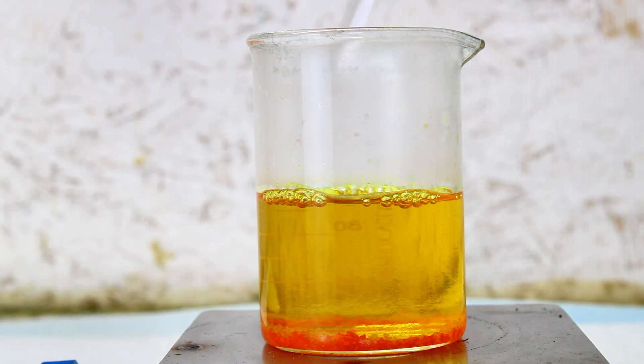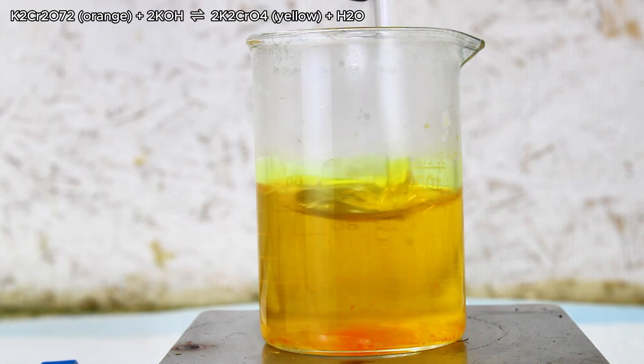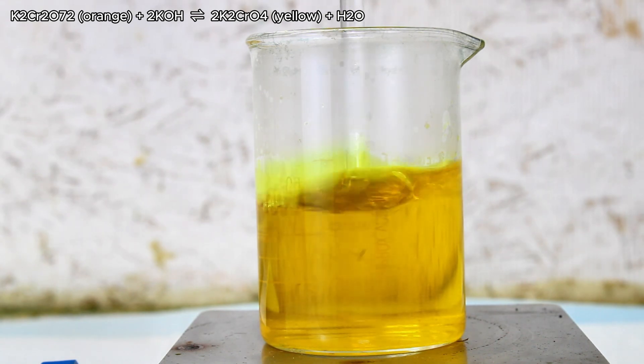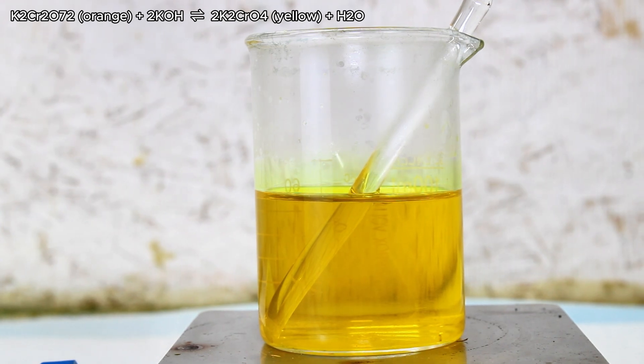For example here, if I wanted to convert this potassium dichromate to chromate, all I need to do is add a bit of potassium hydroxide until the solution goes from orange to yellow. This yellow color means that all the dichromate has been converted to chromate, which I could then crystallize out.